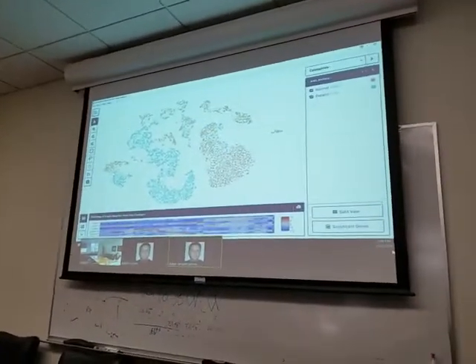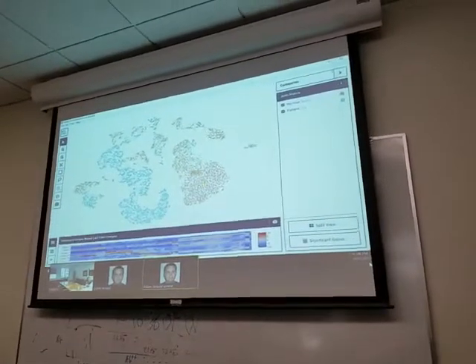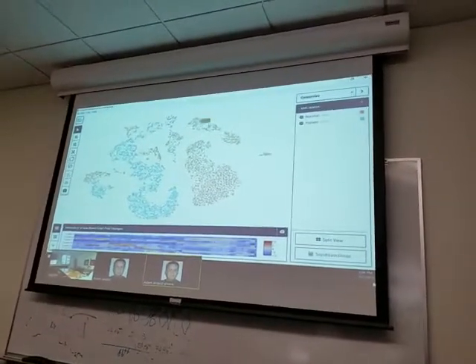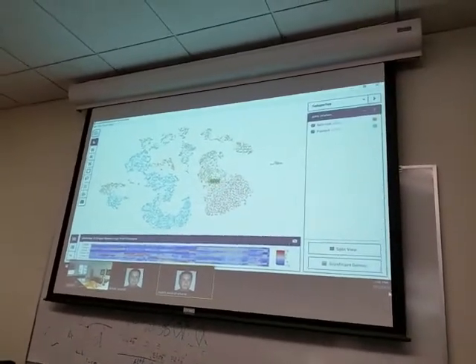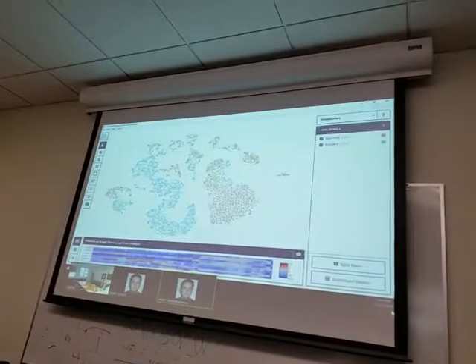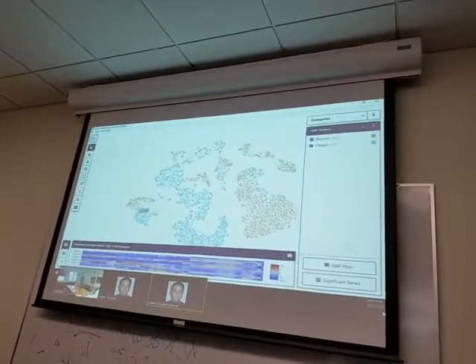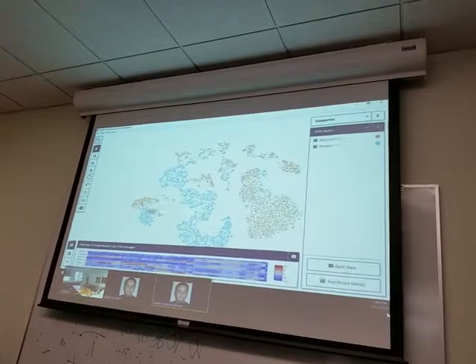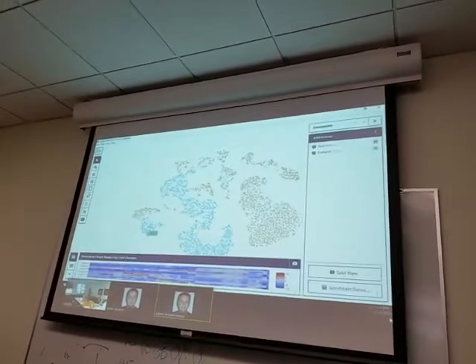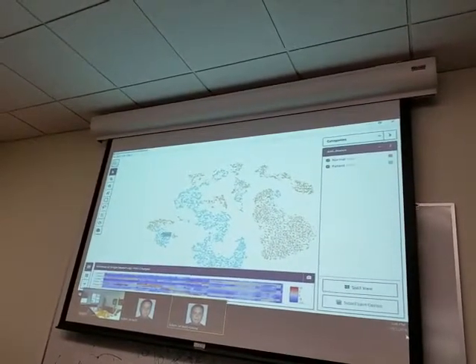And we're doing differential analysis on this, and we're seeing clusters form, and we're seeing that some populations are really present in just one or the other. Let's say this is what you cared about. You could then still go and look specifically at these. I think if you were to cut this out and put this back through the pipeline by itself, it's just going to introduce more and more noise.